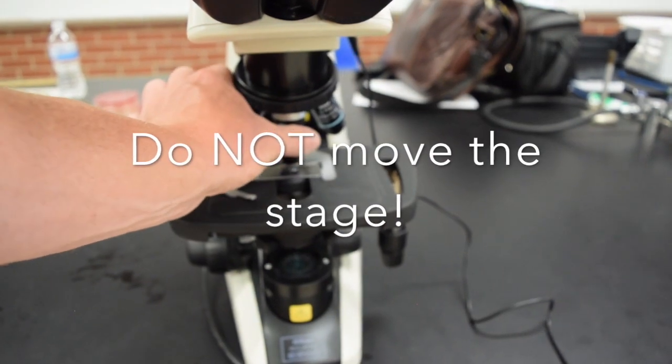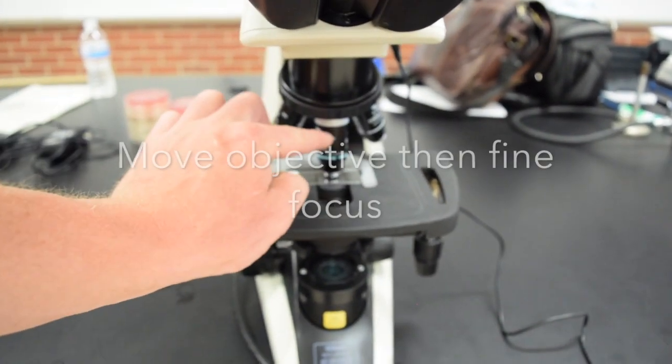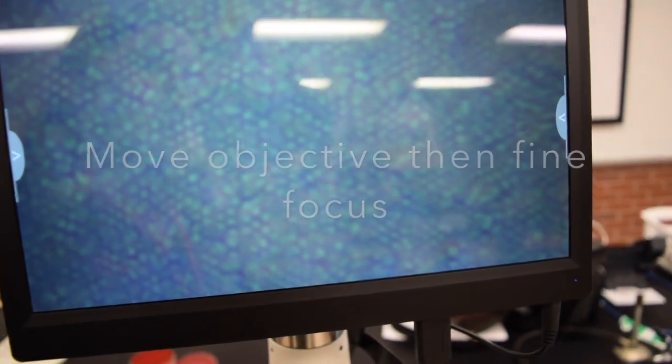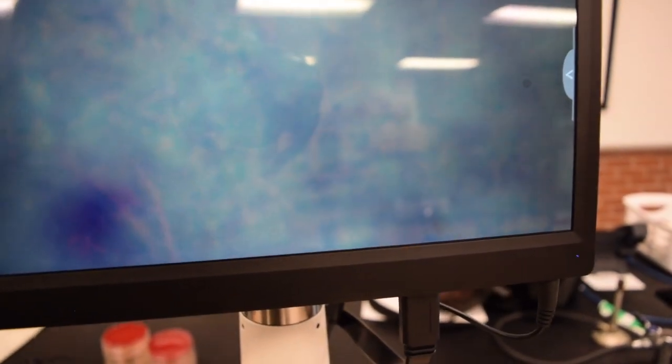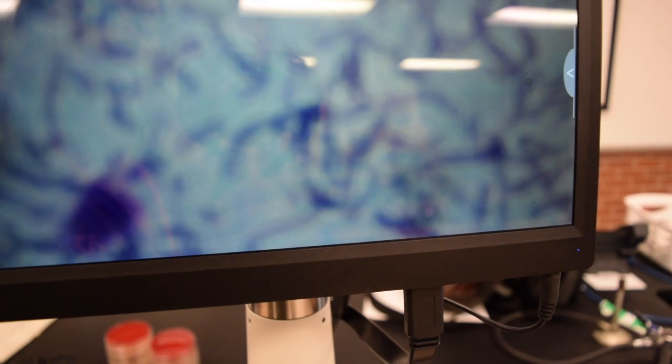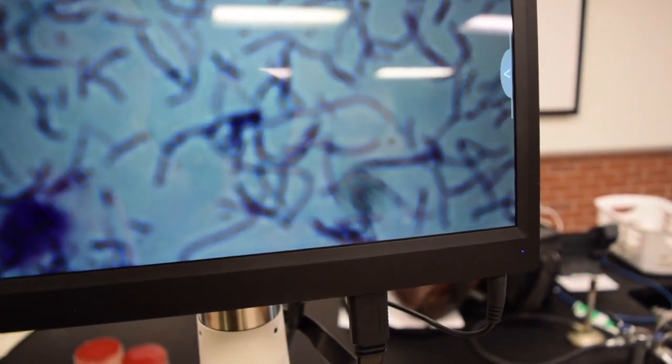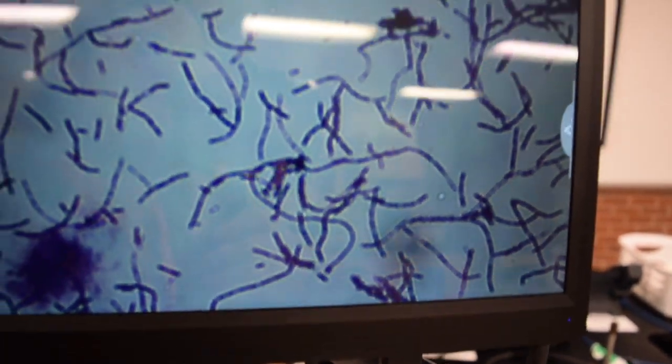Moving to the 40x position - notice how the image went out of focus. From here, all I'm doing is using the fine focus. I'm turning it towards me in this case - just the fine focus, the outer portion, not the coarse. Sometimes you have to turn it away from you depending on the scope. Now we're looking at that bacteria at 400 times magnified.